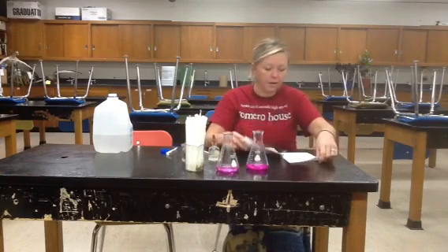Then once again, this will be clear. You're going to add drops of sodium hydroxide to restore that pink color, making sure that you keep track of the number of drops of sodium hydroxide, and you'll record that under vigorous exercise. So you're going to be recording the number of sodium hydroxide drops 3 times. Once after rest, once after mild exercise, and then once after vigorous exercise.